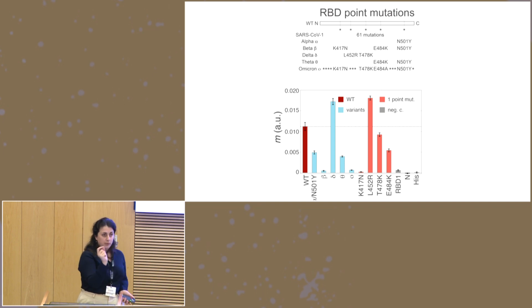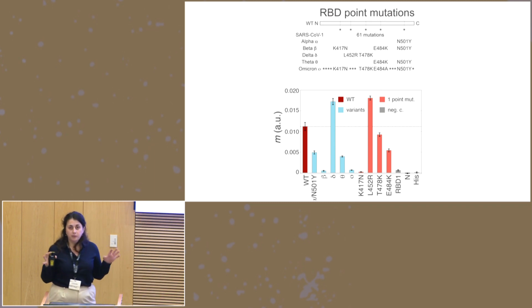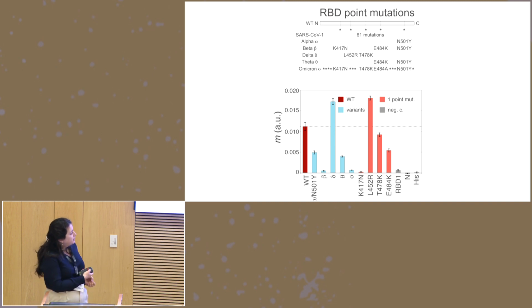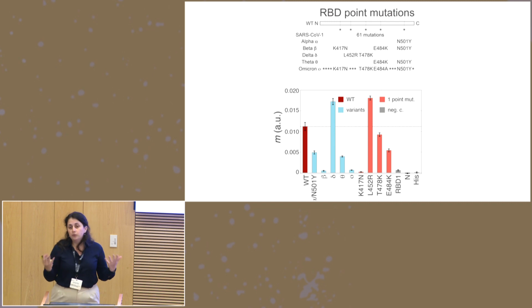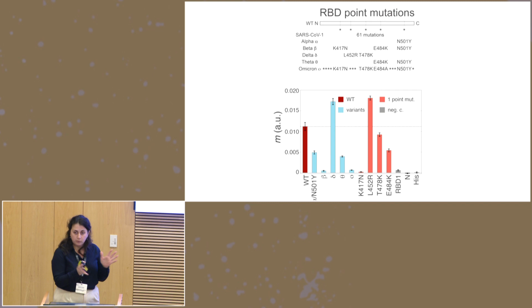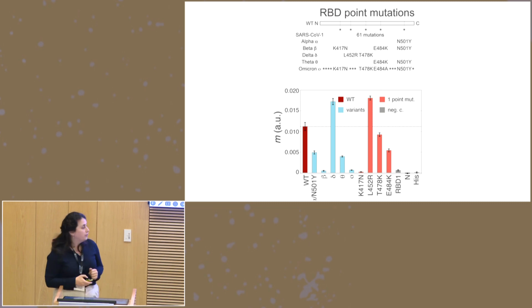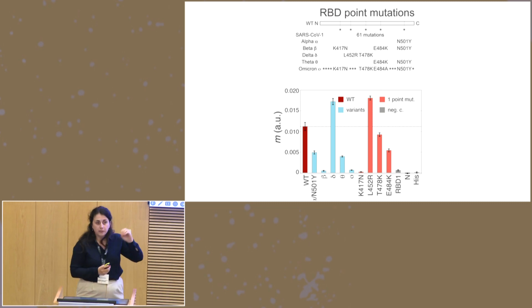And when we come and assess the binding of an antibody, we're getting an epitope reading with a precision of a single amino acid. So for example, you'll see that mutation K417N here deletes binding entirely of this antibody to the antigen. This point mutation is also present in beta and omicron, and those variants do not bind the antibody. So in a putative immune system, those mutations would basically evade your immune system and be able to go through without being detected. We also see that other point mutations increase binding, some are ineffective to binding, and we have a very precise resolution of how the antibody binds.